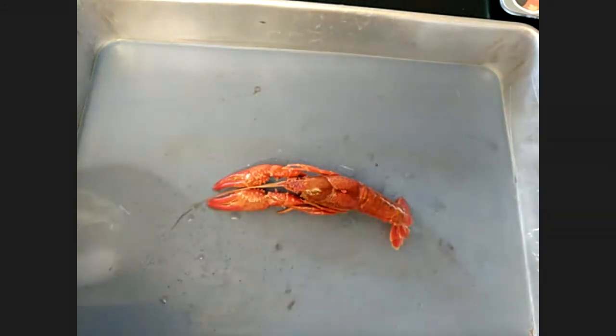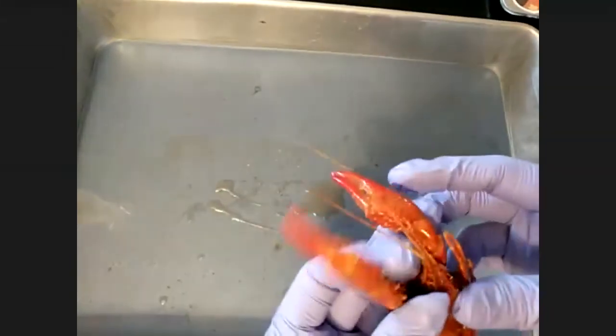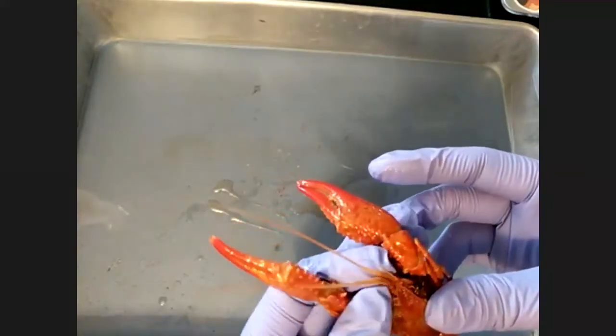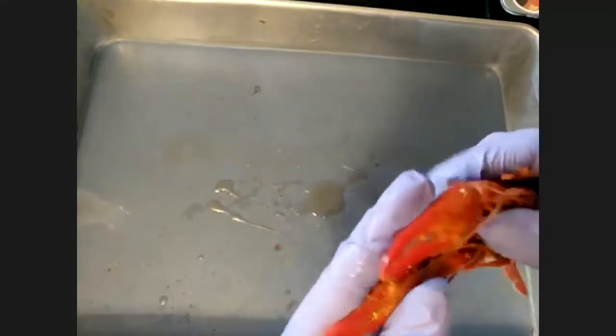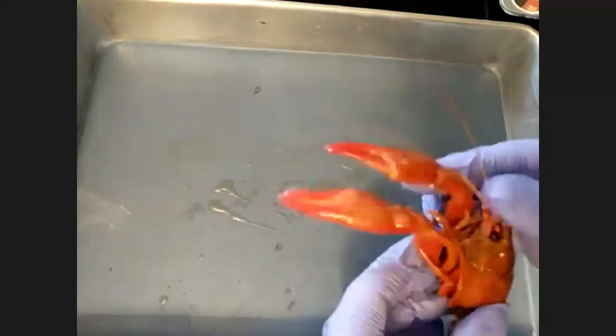So the first thing we are going to do is take a look at the external structures. As you can tell, at the very front it has some nice paired antennae. It also has its very large claws. I can't really tell which one is bigger. They both kind of look the same.